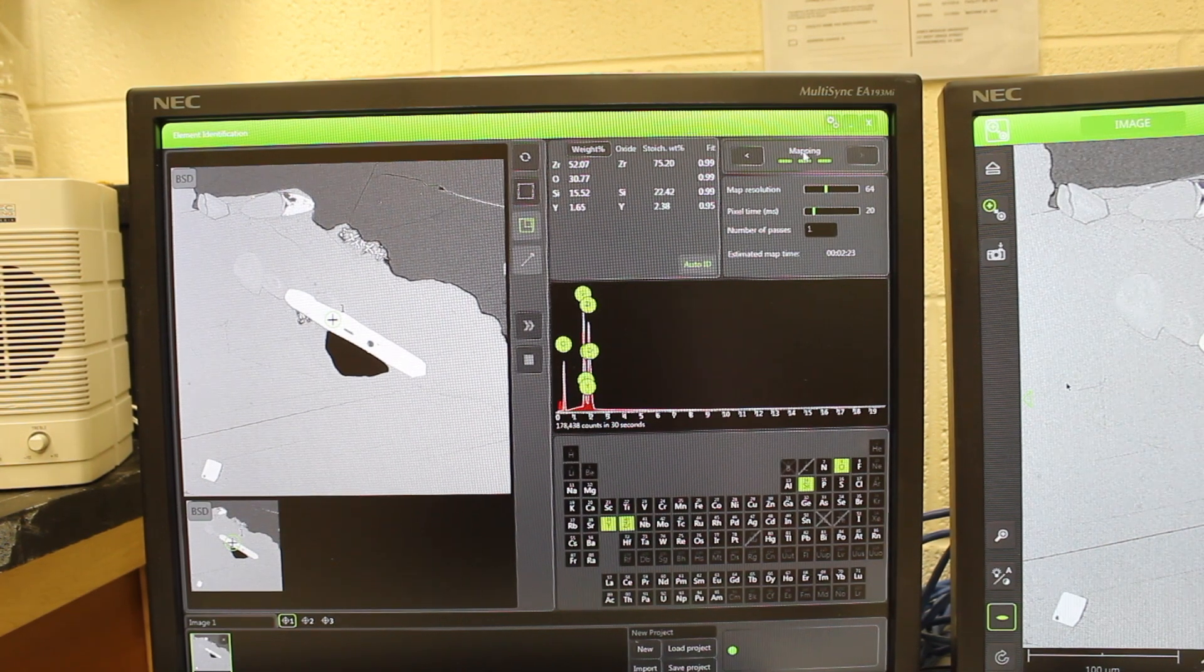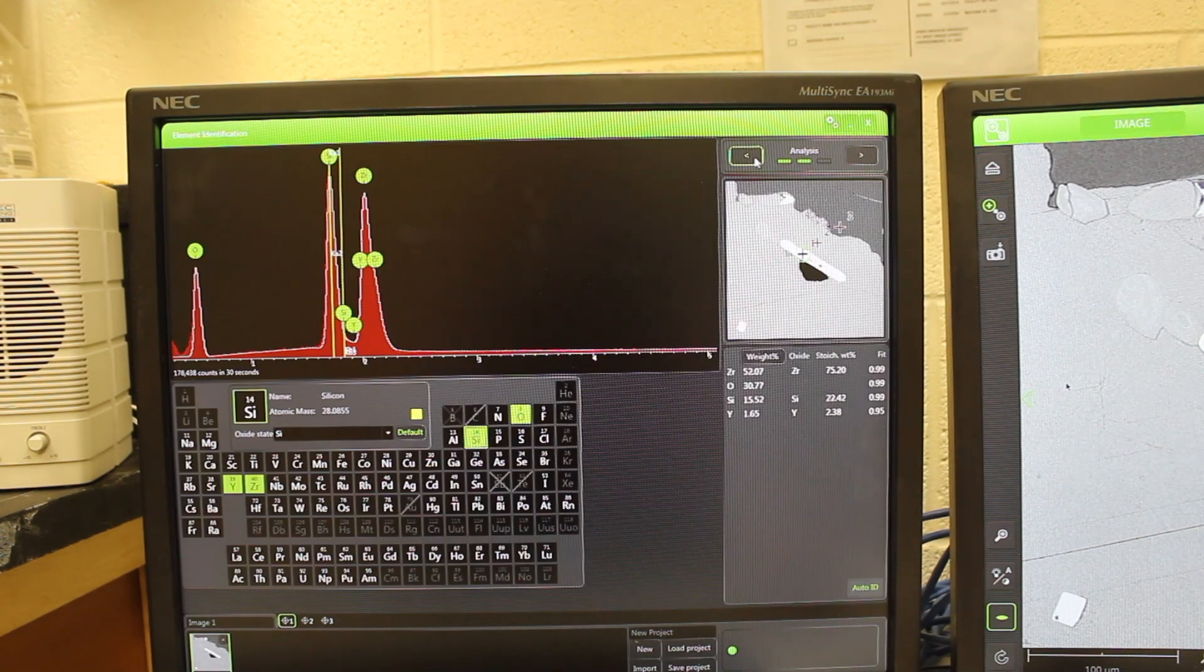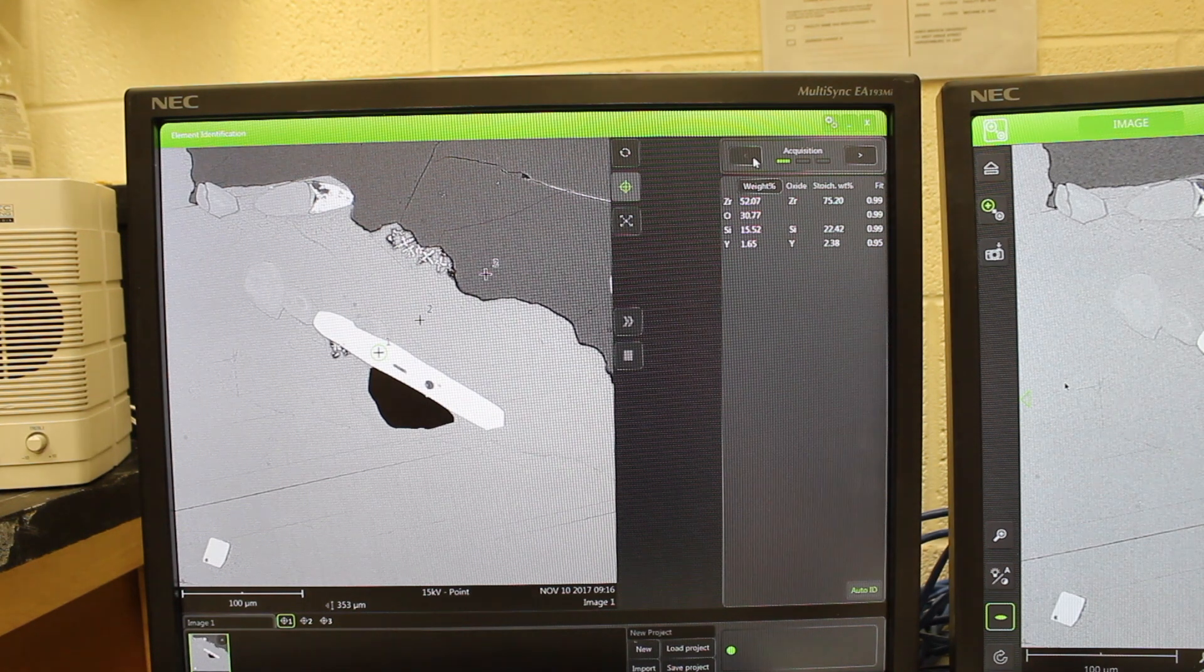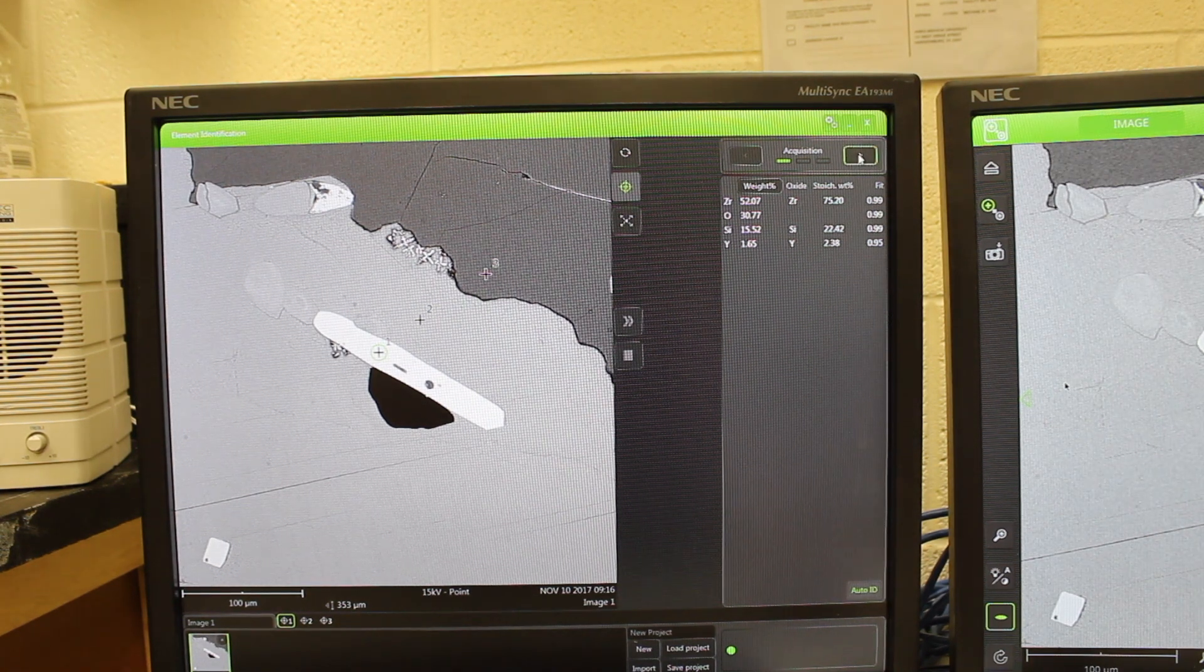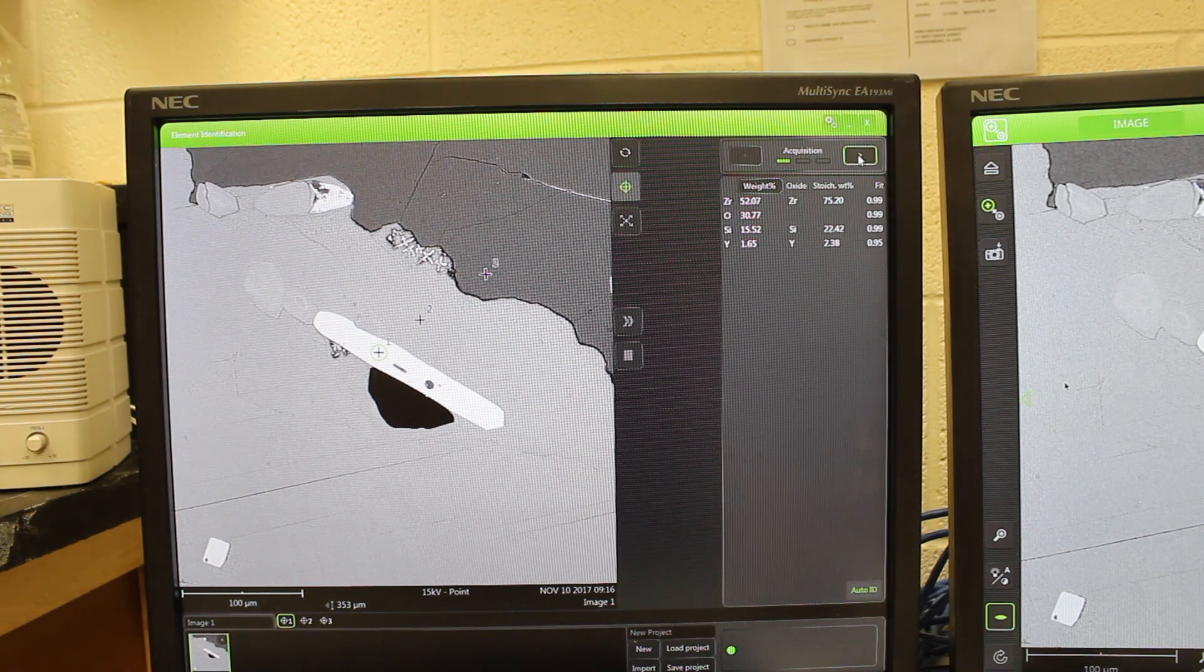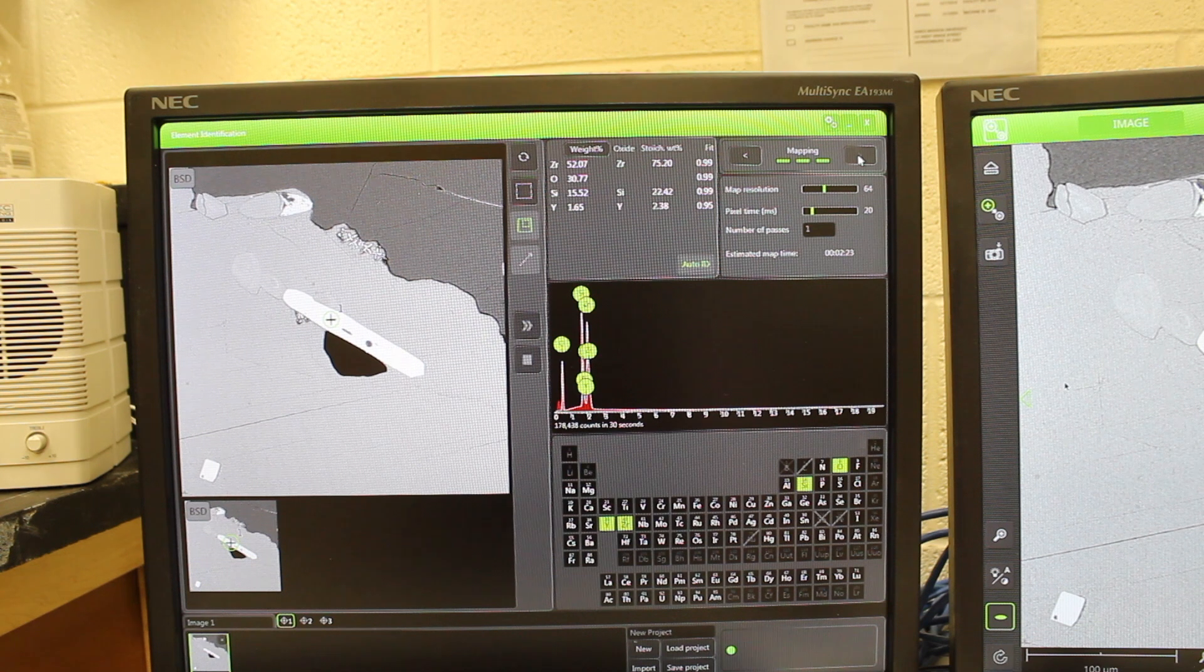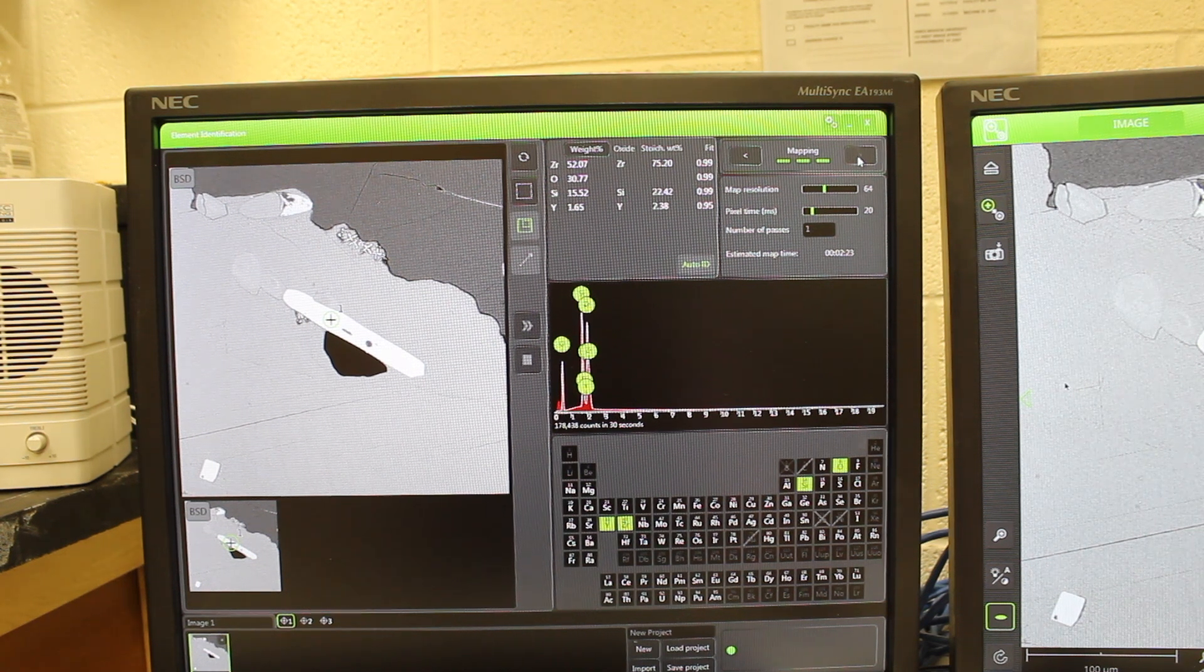If we go to the third window, so we go back to the first, this is the first, the acquisition window for single point analyses. If we go to the third window, this is the mapping window.